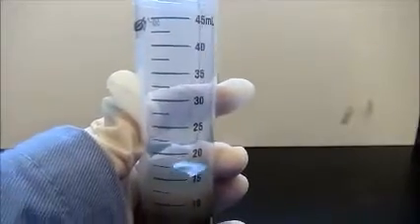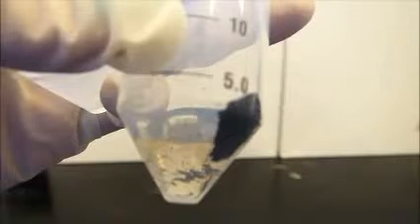Next, we transfer the sample to a centrifuge tube and add 10 milliliters of acetone to wash. After centrifuging, we remove the supernatant and add 2 milliliters of water. Then we sonicate it.